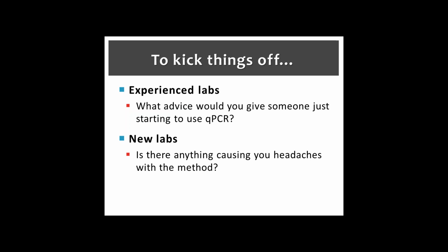I believe that once you have any qPCR method working well in the laboratory, it becomes very simple to move to other targets. So basically, all you're doing is changing the timing of the approach.